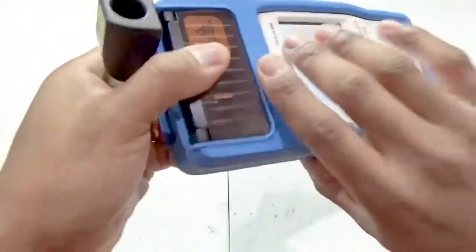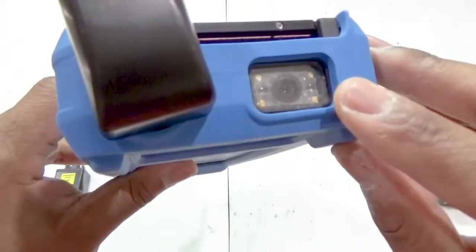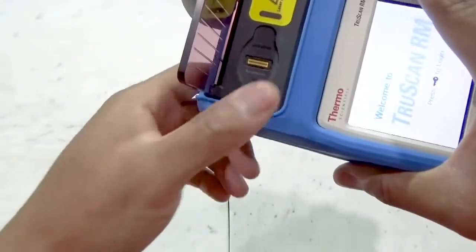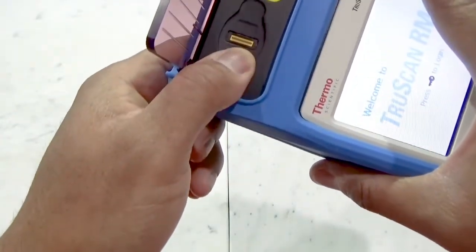The TruScan RM itself has a built-in barcode reader for quick parsing of information and data entry, and it also has a built-in fingerprint reader for quick biometric access to the analyzer for a given user.